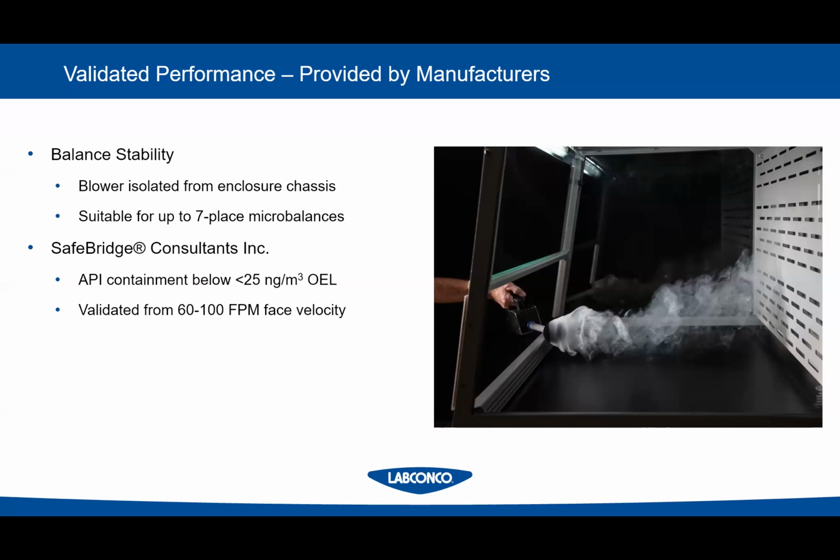Any kind of containment hood you buy, a VBE or whatever they're called, you should be able to get from the manufacturer some type of third-party testing. Now, it is a little bit different. We went through Trinity or SafeBridge. Now they're called Trinity Consultants. Usually what they do in these type of processes is they'll have 3 different people weigh. They've got little sensors around the room and around the person to see how much is getting out.